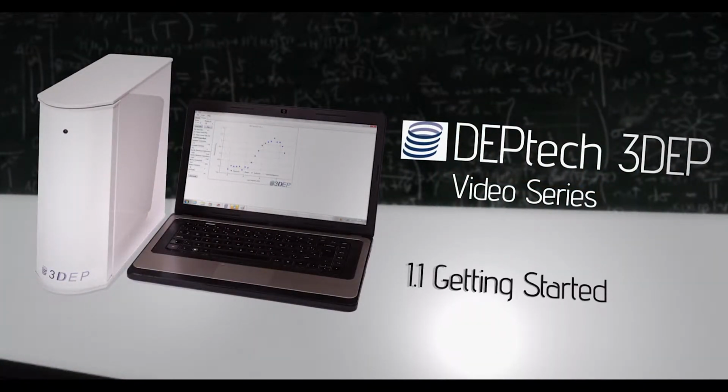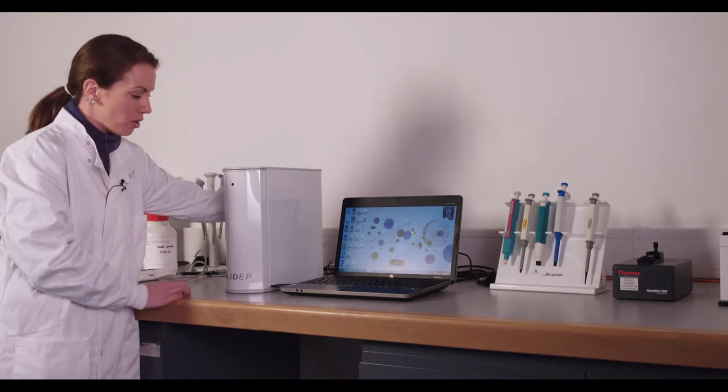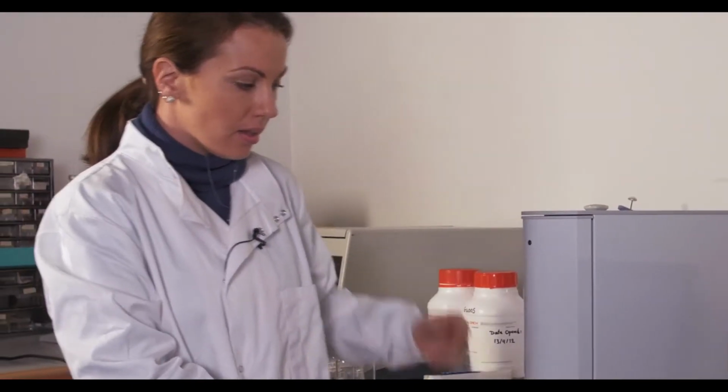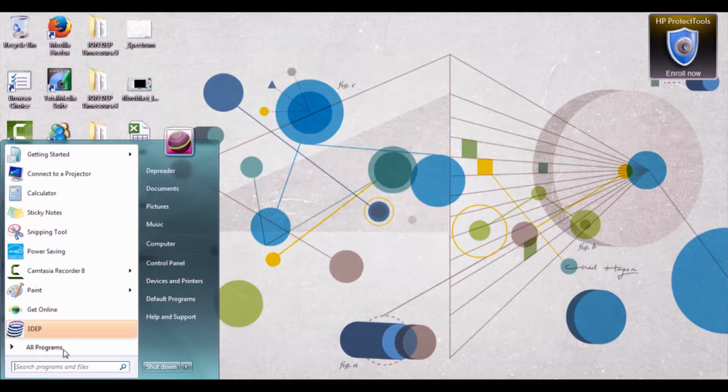When starting your 3DEP software, the first thing you'll want to do is turn the kit on, and that's found on a power switch on the back. When the kit's on, the light on the front of the kit will turn on. You'll also hear the kit turn on, and once that happens, you can start your 3DEP software.